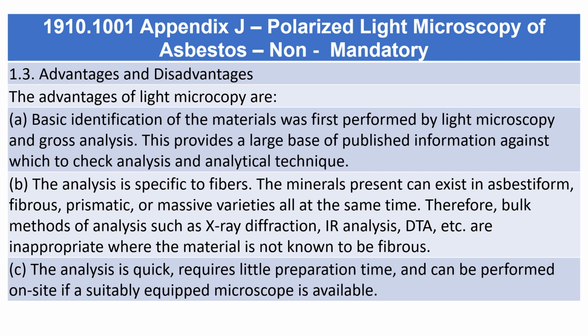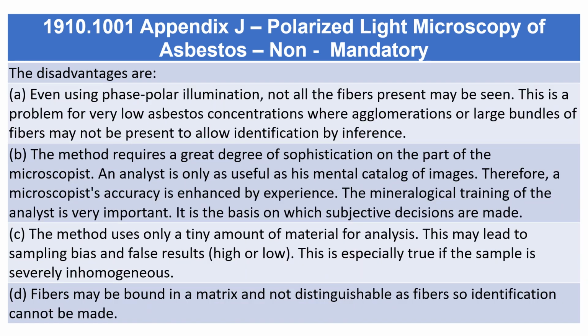C. The analysis is quick, requires little preparation time, and can be performed on-site if a suitably equipped microscope is available. The disadvantages are: A.